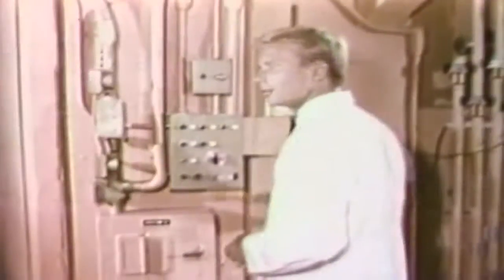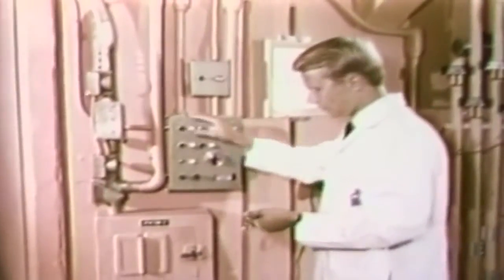The nuclear reactor has a system of pneumatic tubes that can carry encapsulated small samples directly to the core. It is monitored, like every phase of reactor operations, through the central control room. The FBI examiner has placed his microscopic samples into a small container called a rabbit and inserts it into the pneumatic tube system.